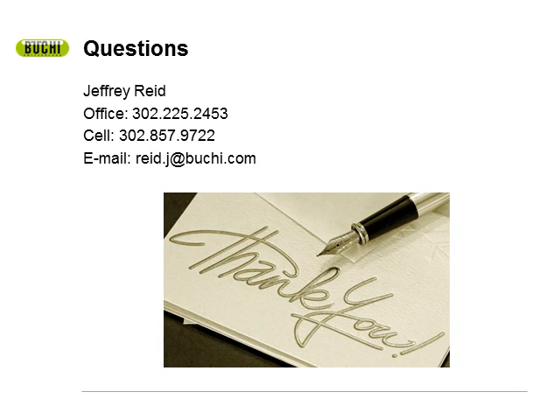One of the questions is, do we actually supply solid phase extraction cartridges. We do not supply those. We have a deal with Silicycle that supplies these cartridges. The deal is they will give you application support and help build your application more, and that's who you would get the cartridges from.